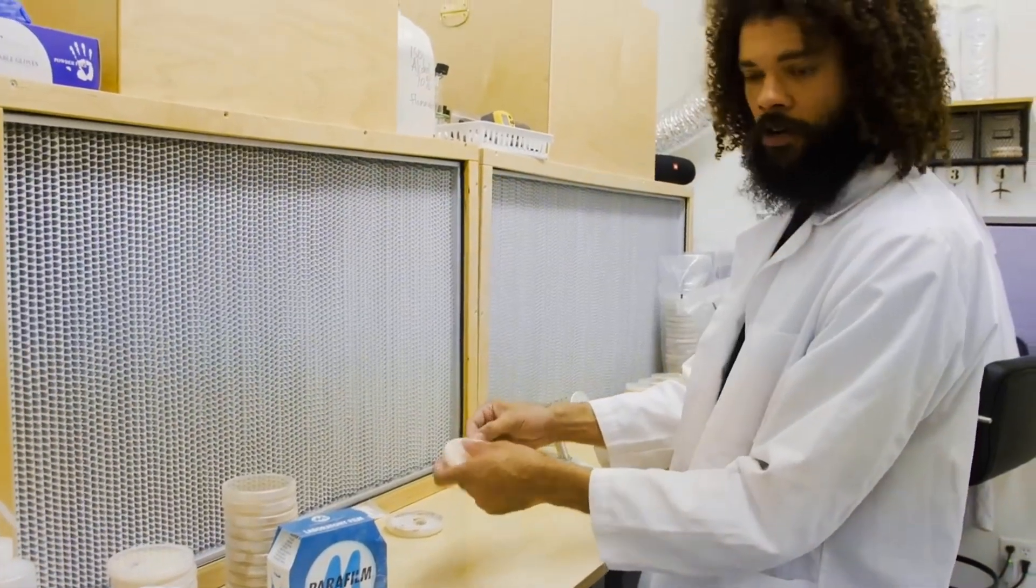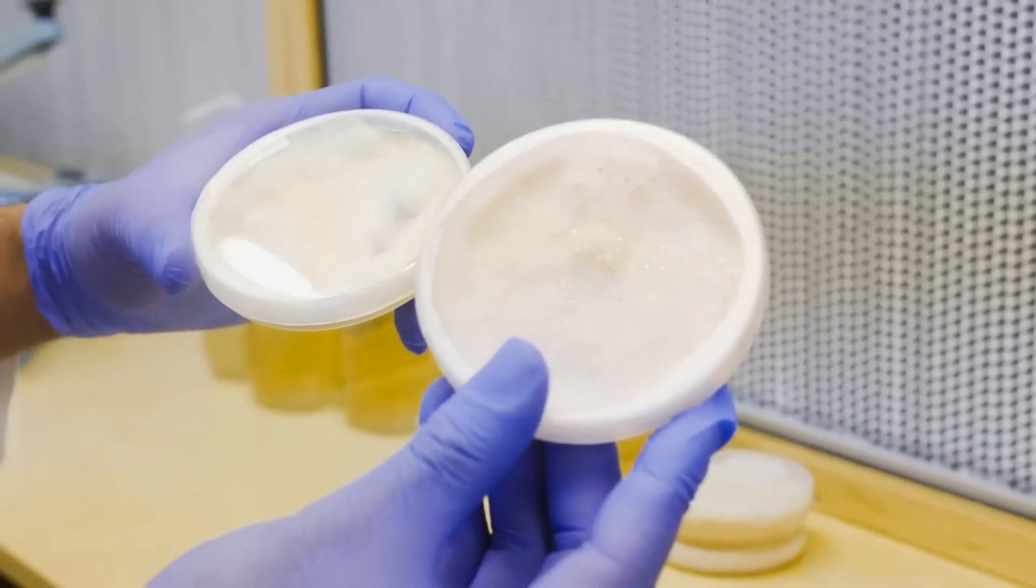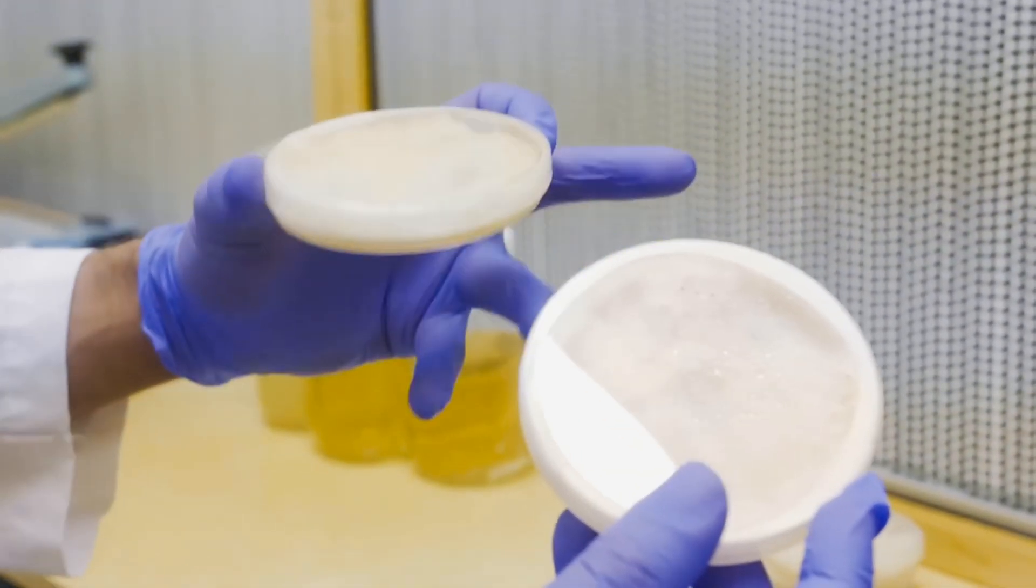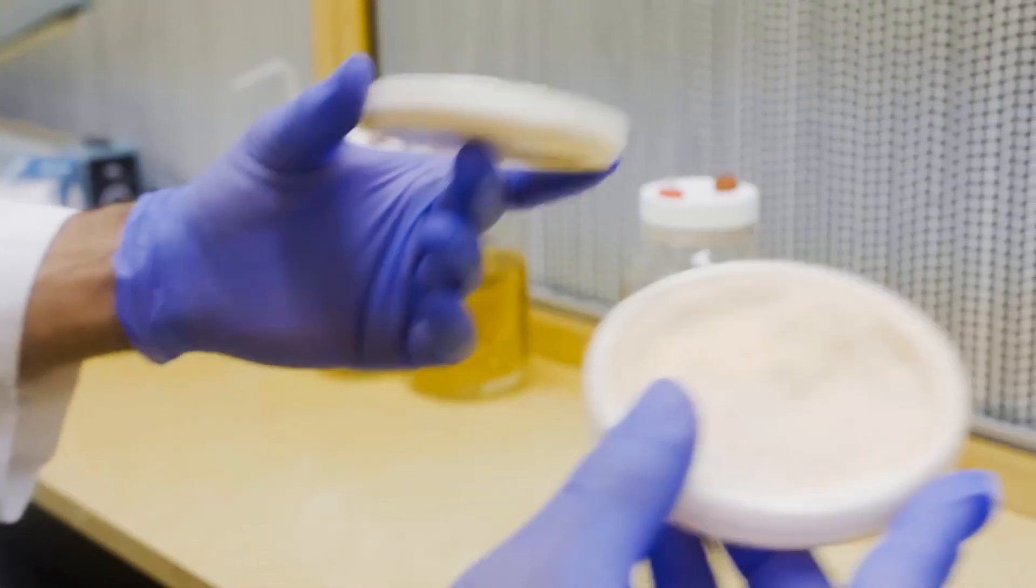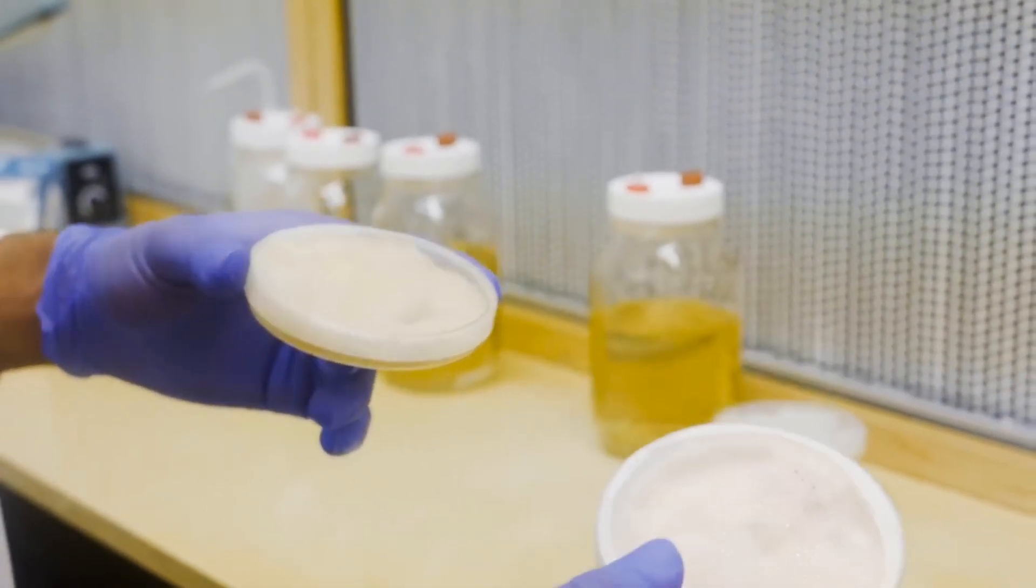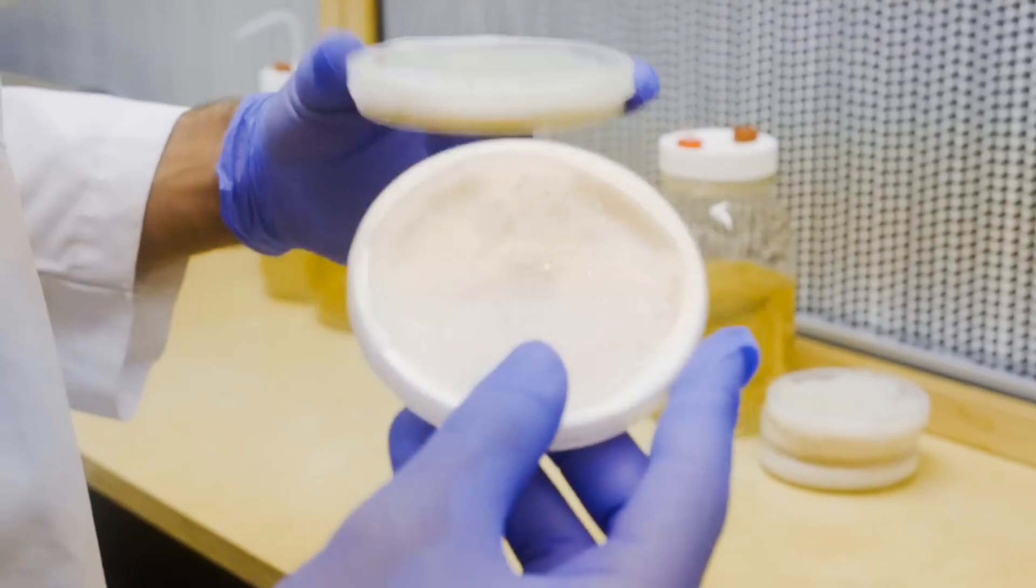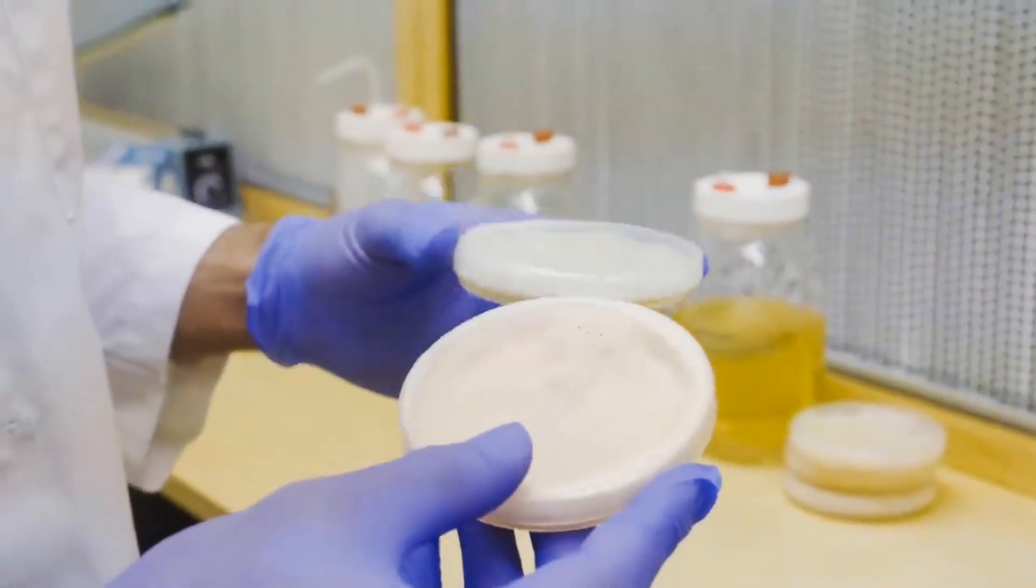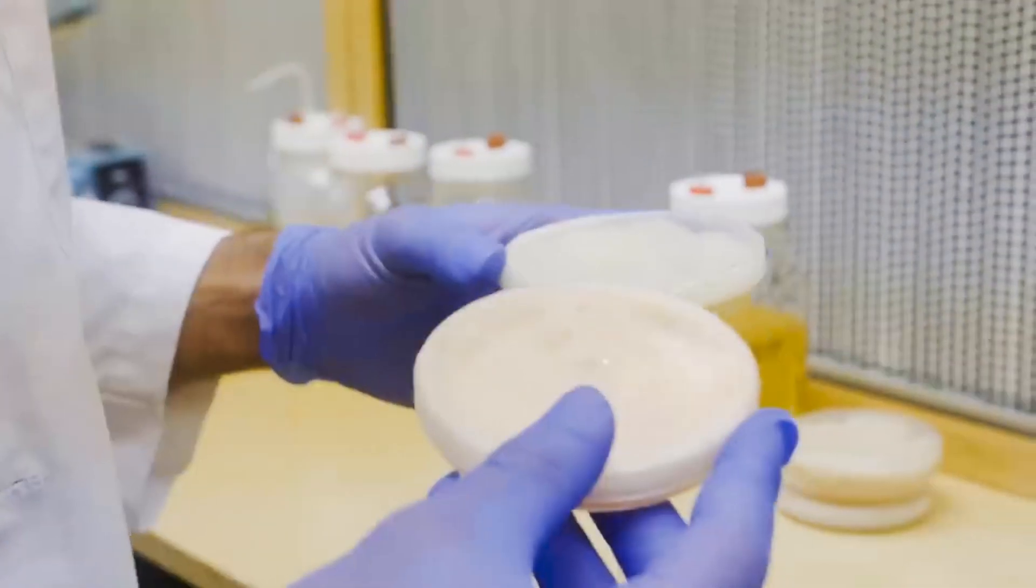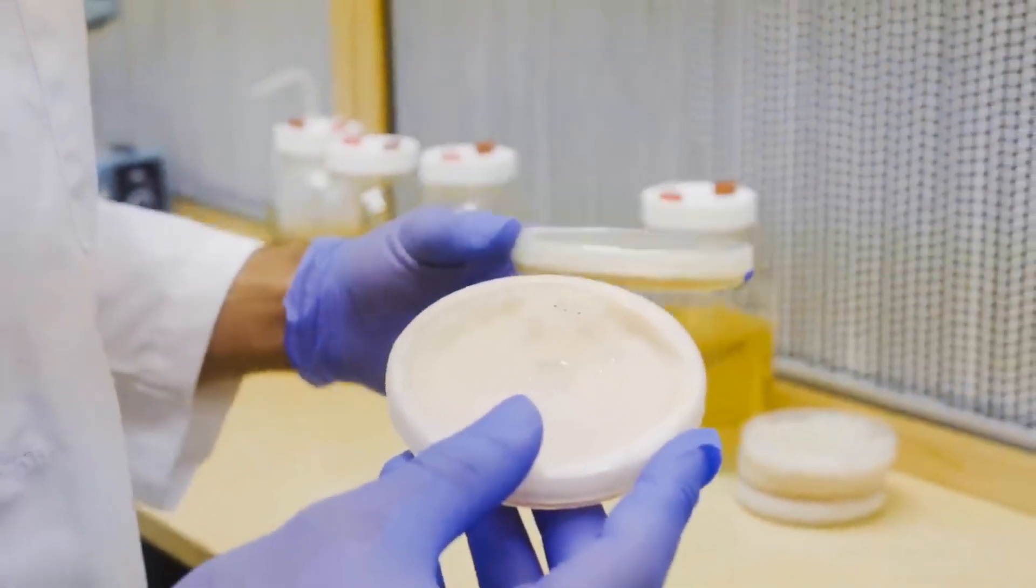This is our pink oyster. You can notice the mycelium is pink. Every mycelium is different for each strain, so it's pretty cool. You're gonna see these unique characteristics in your mycelium, and once you become familiar with the cultivation process you can really identify strains just by looking at the mycelium.